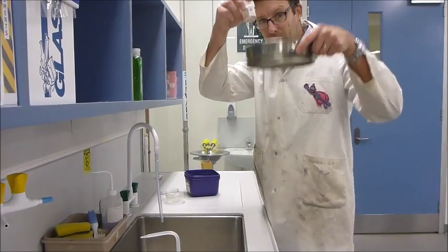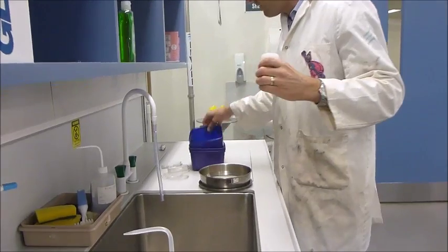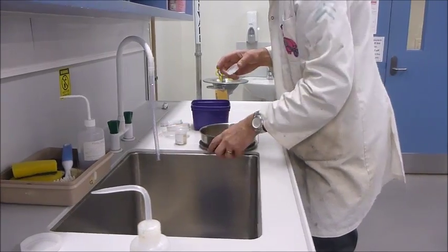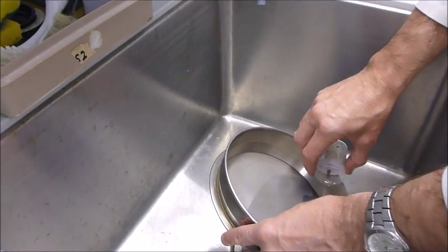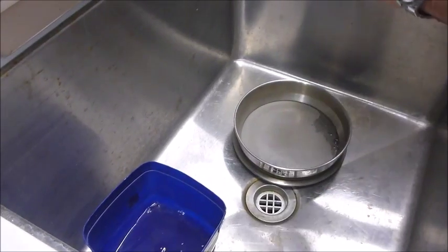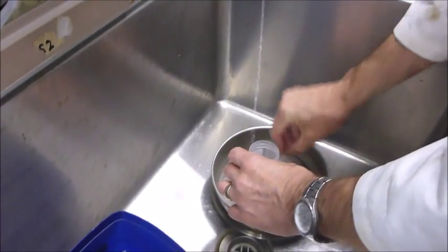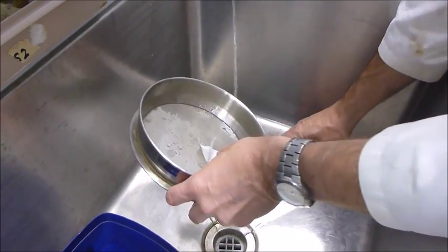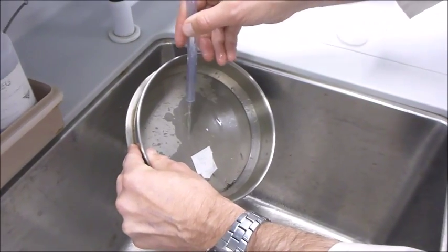We're going to put our sample through the sieve, like so. But we want to use this ethanol again. So as I pour this through the sieve, I'll keep that ethanol and I'll put that to the side. I'm going to wash out my jar to make sure I get all the bugs out, and wash down the sides of the sample so it's all in the bottom.